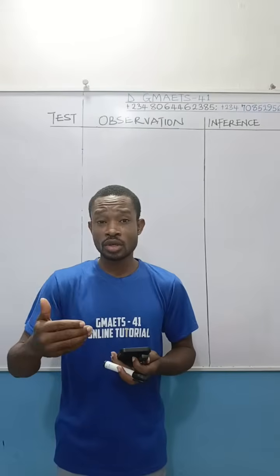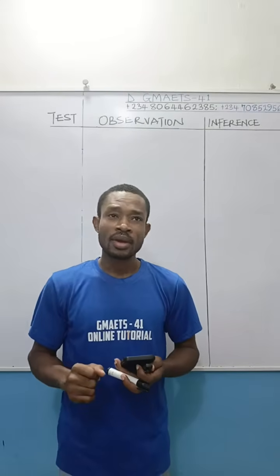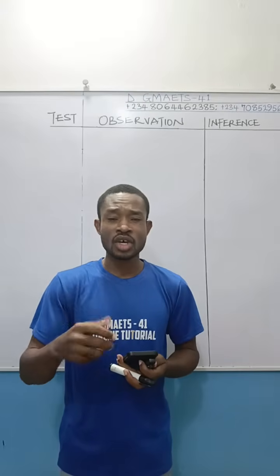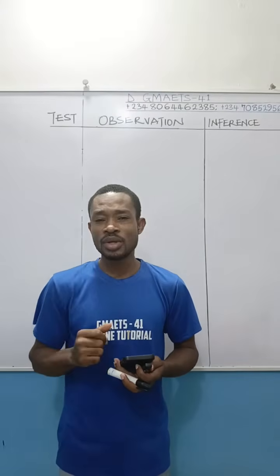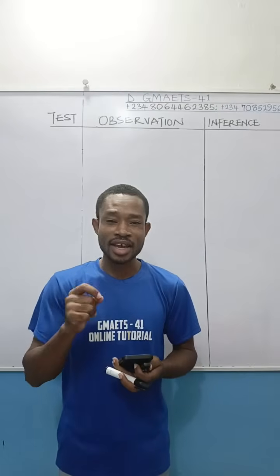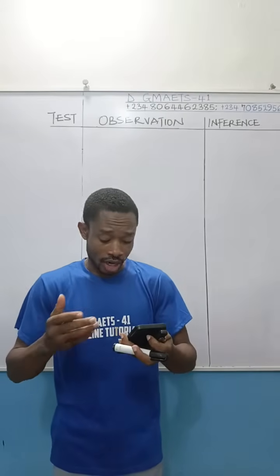Ammonia is used to check whether the precipitate will dissolve or not, as the case might be. And then for the sulfate ion, SO3 2- and SO4 2-, specifically we use barium chloride and hydrochloric acid, dilute form. Instead of barium chloride, you can use barium nitrate.